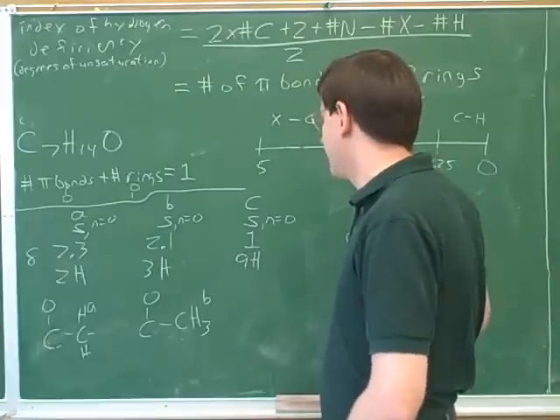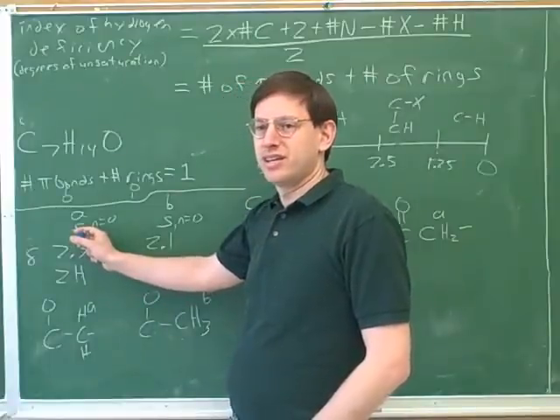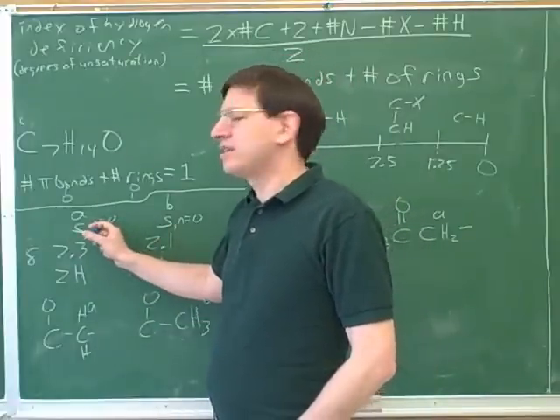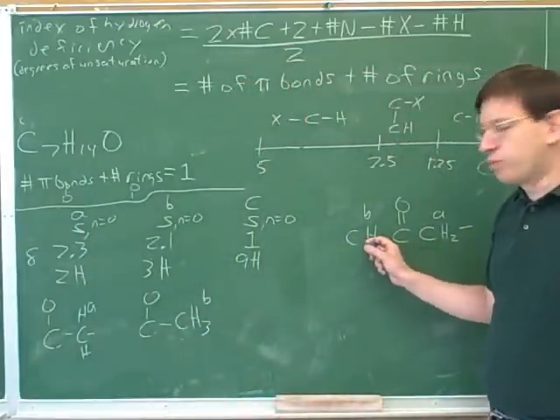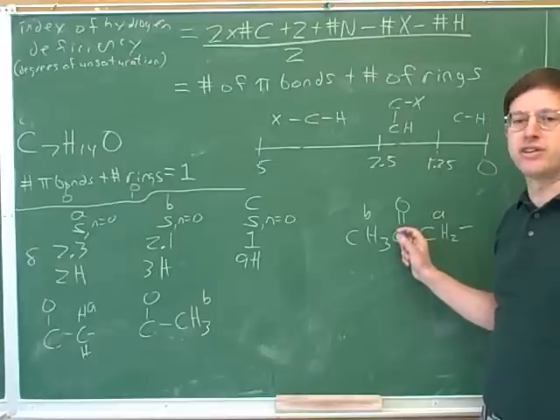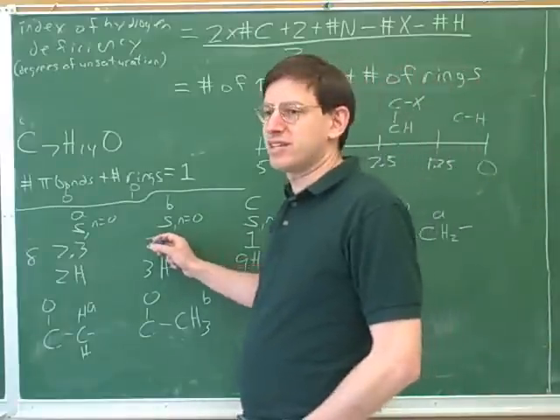Let's look at something else that's very helpful to us here. Now we're starting to explain the singlets. Remember that this should be adjacent to 0 hydrogens. Well, that works over here. Can you see that this group would have a singlet because there's no adjacent hydrogens over here, no adjacent hydrogens.